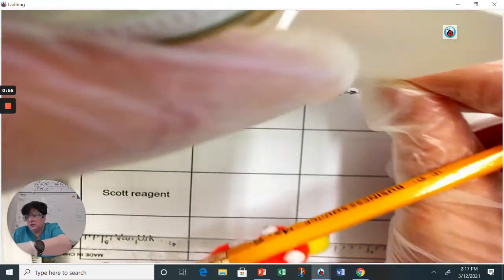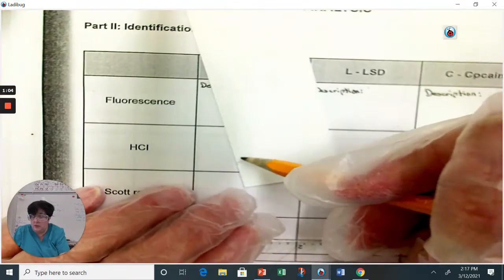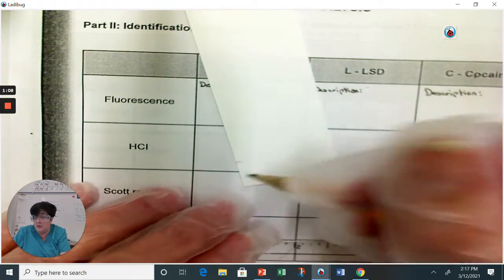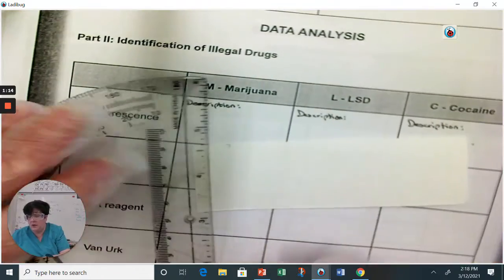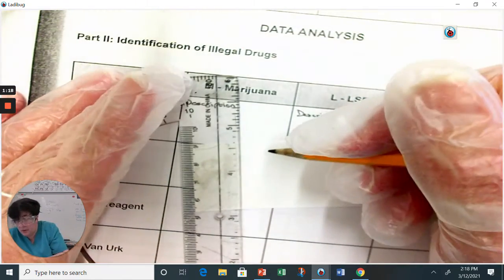So I am just going to do a quick measurement for myself here to see where the height is. If I stand my chromatography paper up there, I will know I want to put my start line above that. So when I put the chromatography paper into the liquid, this line is not below the top of the liquid. If you do that and it's below the top of the liquid, then what happens is your material just goes into the solvent and never goes up the paper.